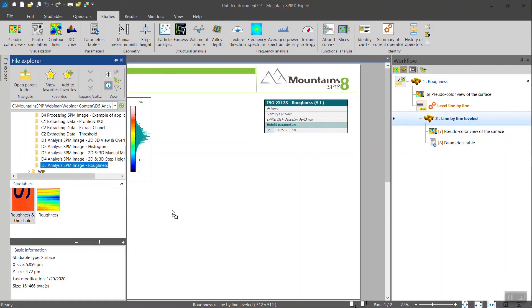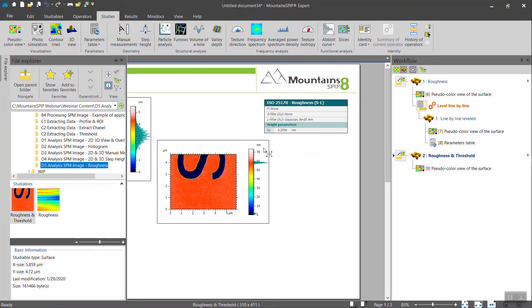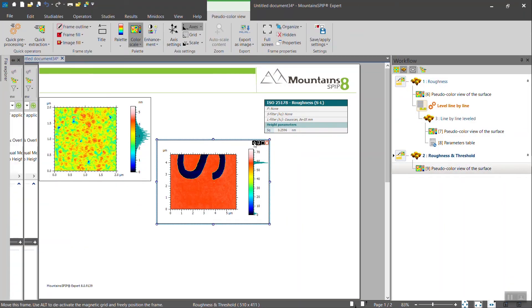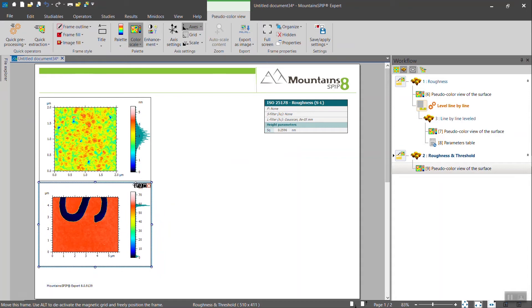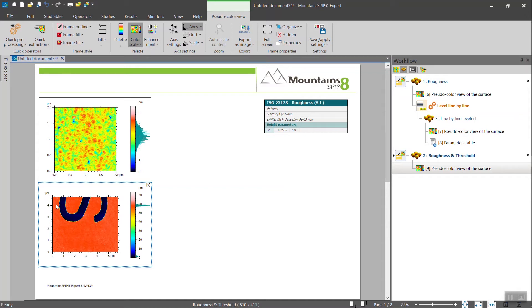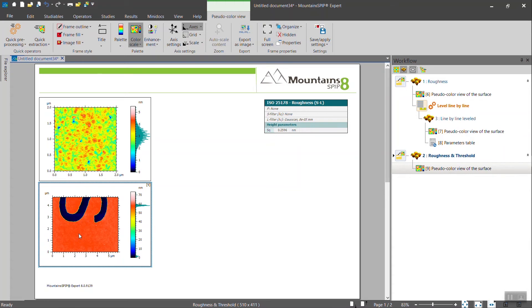We have prepared another example, this one. And you see that from the histogram, there are two steps, two planes, the top layer which is here, and the bottom layer which is the S shape. I will show you how to use the threshold operator to extract both layers and calculate roughness parameters on both layers for comparison, for instance.